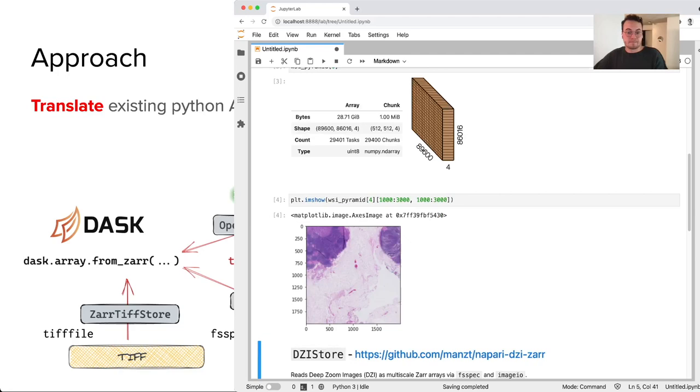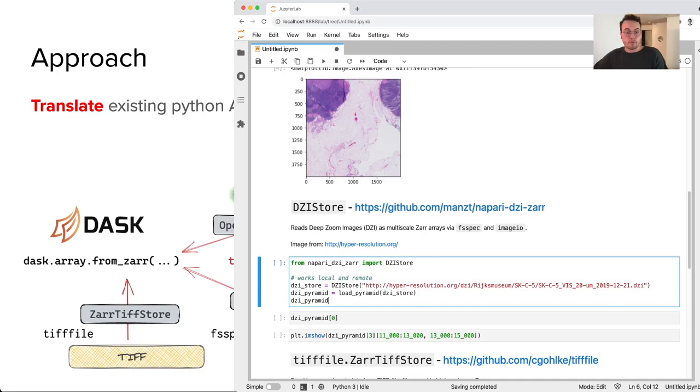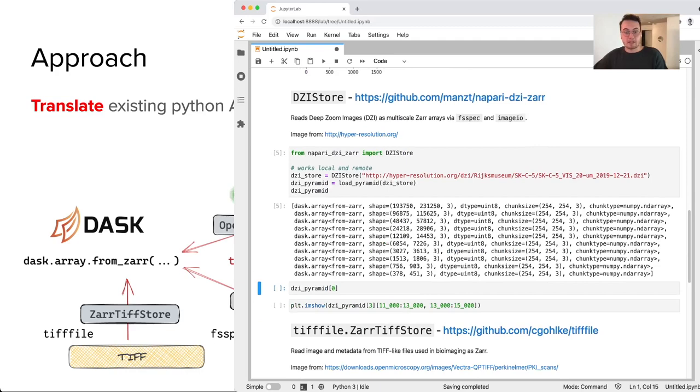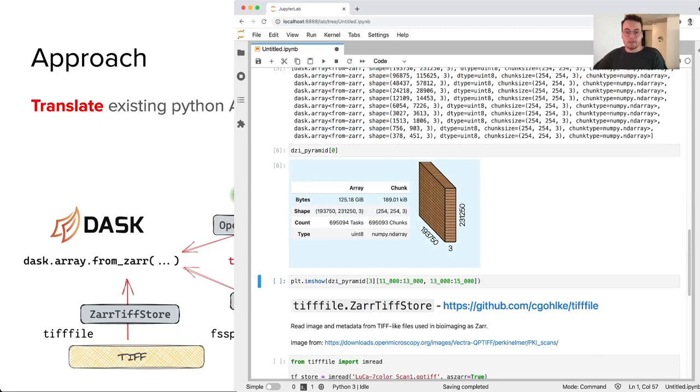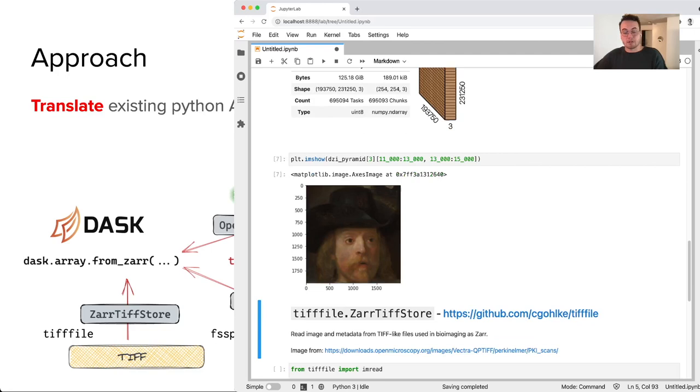Similarly, I can take the DeepZoomImageStore, and for a remote DeepZoomImage, I can load the image pyramid. Again, I can inspect the highest resolution. This one is much larger, 125 gigabytes in memory. And again, I can draw a particular region from a different level of that image pyramid.